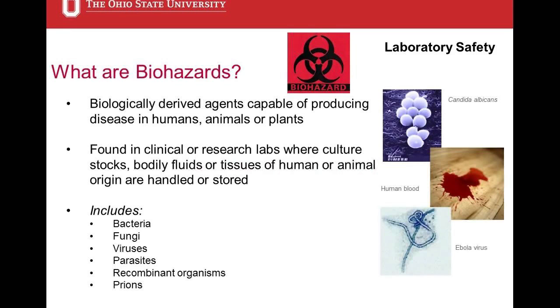There's also animal biohazards. These are the ones that make our animals sick. There's also plant biohazards. These are the ones that make our trees sick and our flowers sick. We have them all here at OSU. We have a large plant program where they study plant disease. They work with plant biohazards.